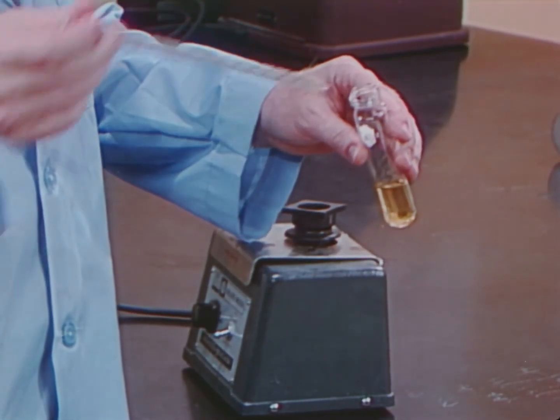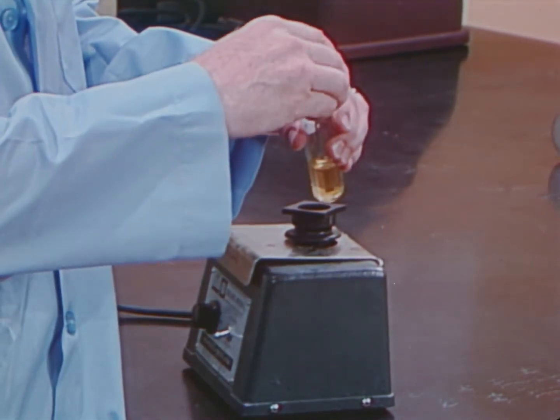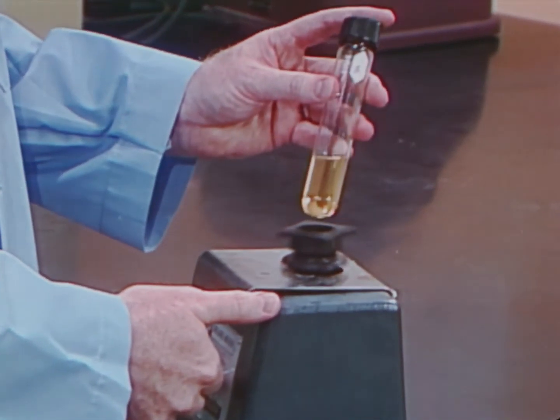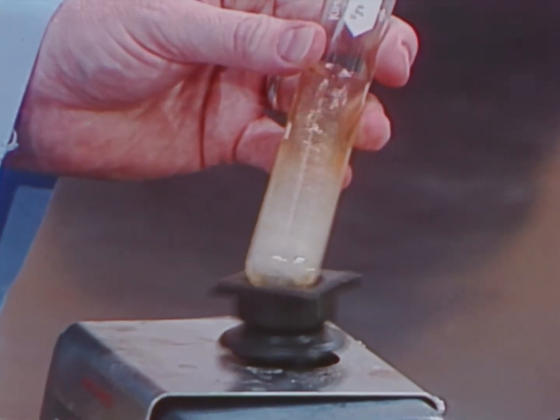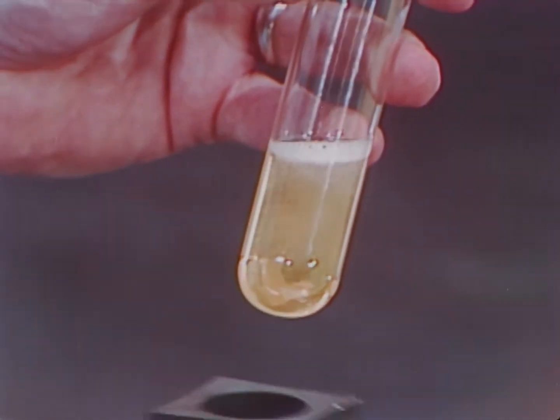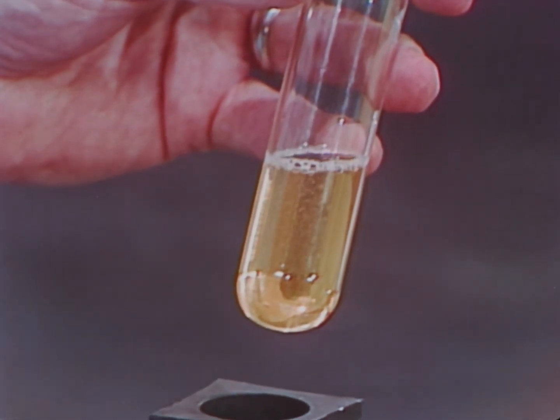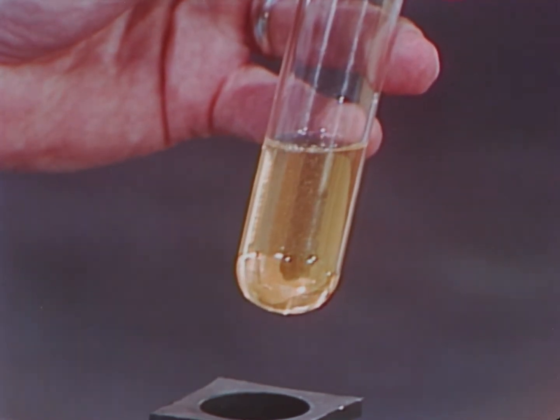You may reduce bubble production by using one of several available test tube mixers. Here, mixing is centrifugal, forcing organisms toward the walls of the container rather than producing bubbles. When the tube is kept closed during mixing, the nearly saturated atmosphere in the tube greatly minimizes droplet nuclei formation. Some large droplets, however, may escape as the cap is removed.